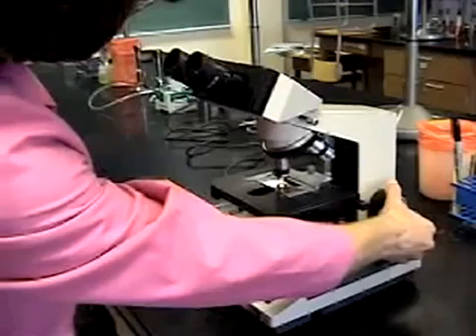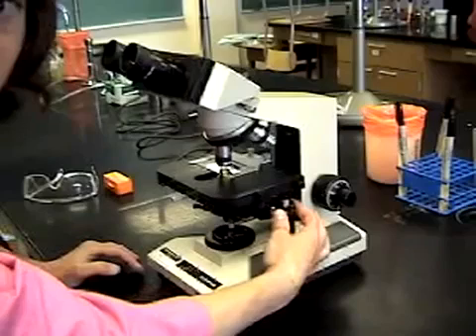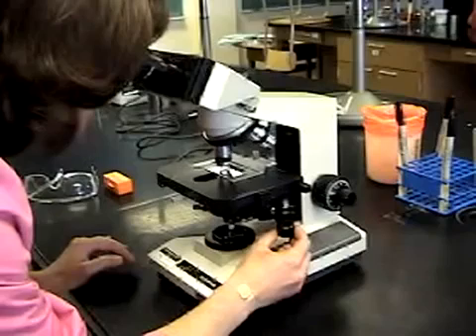Now we're almost ready to look at it. Place it on the stage of your microscope. Notice that your specimen holder has one flexible arm to the left-hand side — use this flexible arm to allow you proper placement of the slide. With your 10x objective in position, use your coarse adjustment knob to bring the stage up as close to the front of the objective lens as possible.